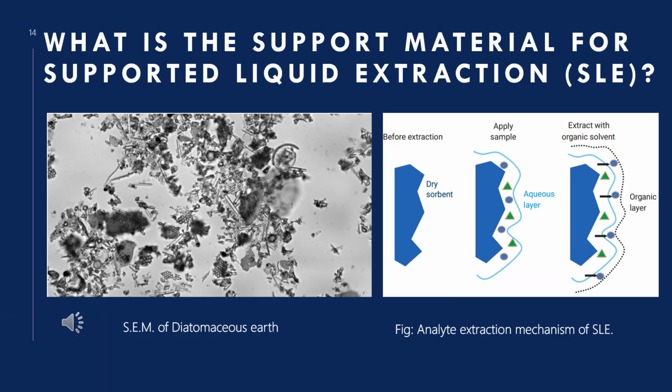Hello everyone, I'm Nusrat Yasmin and I'm covering the middle part of our topic. The supported liquid extraction method is based on the same principle as liquid extraction, but there are a lot of advantages of this method over the liquid extraction one. So I'm mostly covering the advantages of this method.